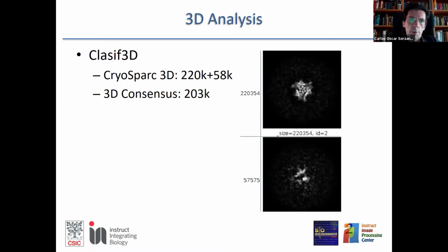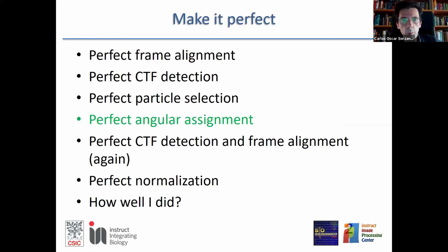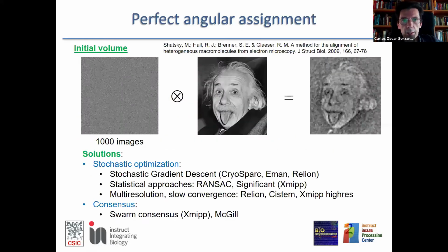But if you repeat this process, 3D classification is a relatively unstable process, and you discover that 10% more of the particles assigned to the supposedly good class were jumping in and out of it, sometimes being assigned to the bad class. You may think that because the good class has a higher signal to noise ratio, they are attracted by it. We will go more into that idea later.